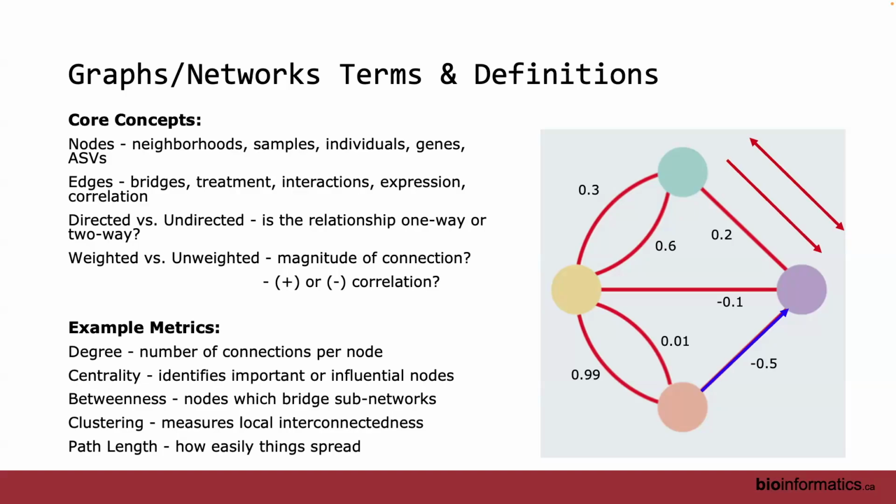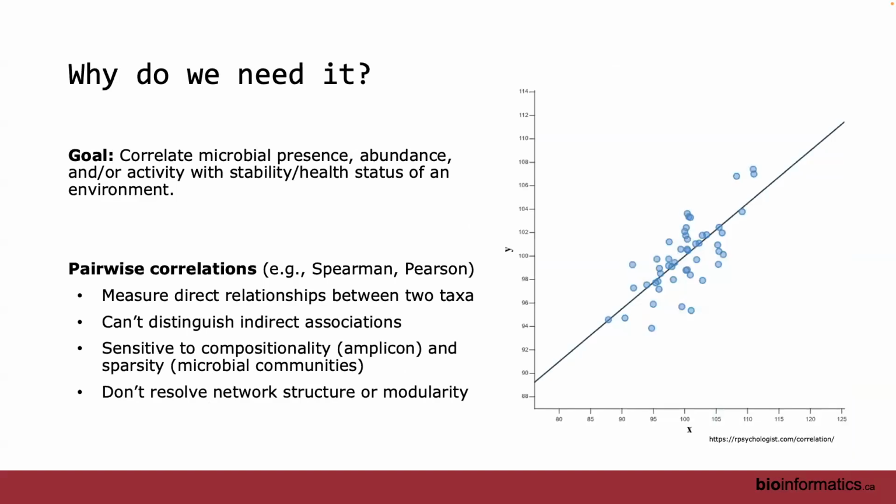There's clustering, literally just looking at how closely they cluster to each other within the network. And I'm going to show you a couple examples of biological systems where you can see clusters and a number of these different metrics visually. And then there's also path length, but there's a bunch of other types of metrics. These are just some of the more common examples.